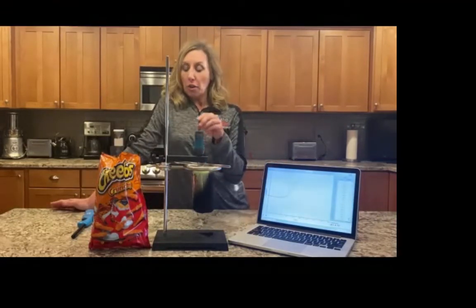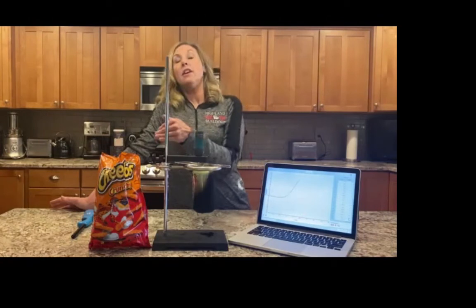Then what you're going to do now is figure out how much heat was released for the burning of that particular Cheeto for each trial. Then you're going to convert it to calories. Then you're going to compare it to the label on the back of the Cheeto bag. There'll be a picture of that nutrition label, and you'll do some calculations with that. I walk you through all of that in the lab itself. I've got all the formulas pre-set out for you. So work through that, do the best you can, and let me know if you have any questions.